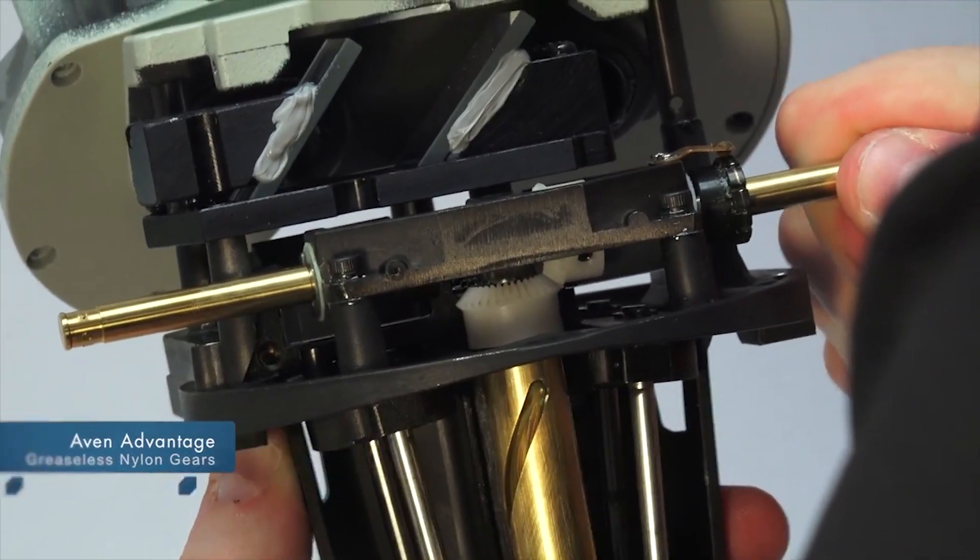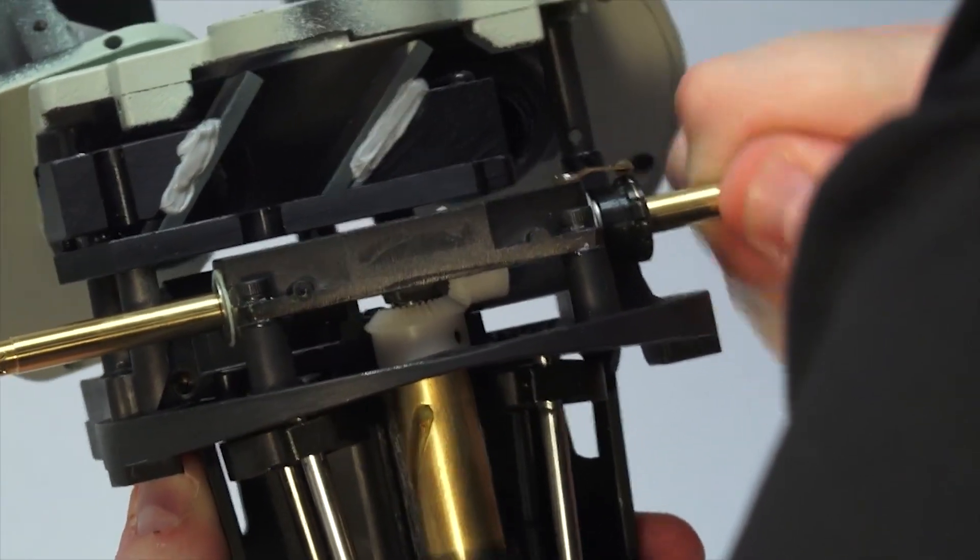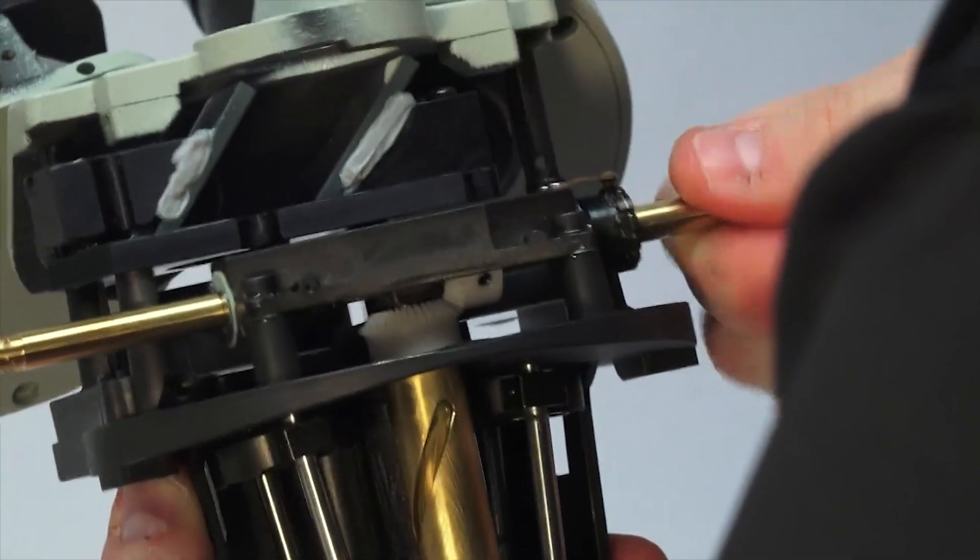Greaseless nylon gears: industrial strength gears with tight tolerances operate smoothly with virtually no grease or oil.